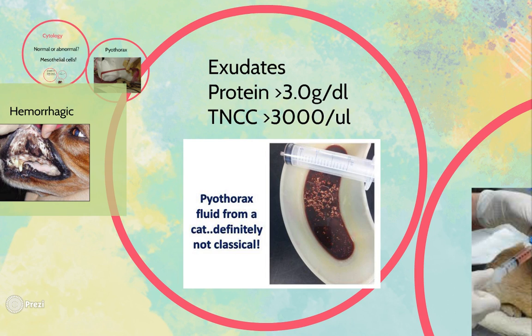So we always have to keep an eye out for microorganisms hanging out. If you see a lot of healthy neutrophils, so hypersegmented neutrophils, not terribly karyolytic or karyorrhectic, then that's most likely going to be a non-septic sample. If you're seeing tons of degenerate neutrophils, keep an eye out for bacteria.